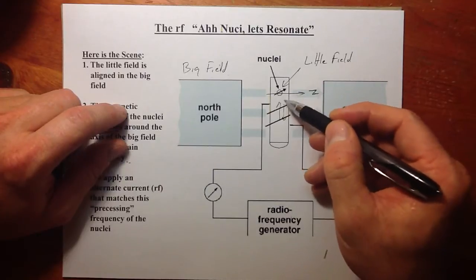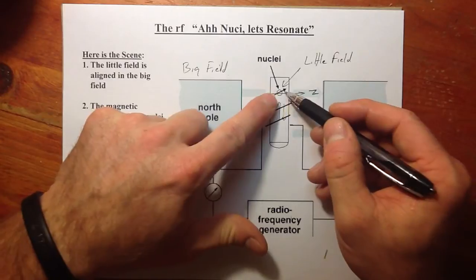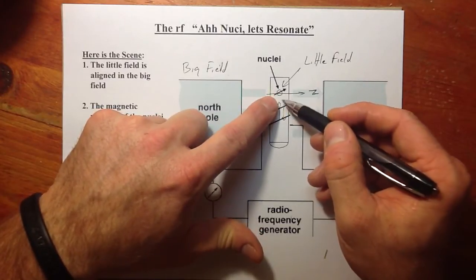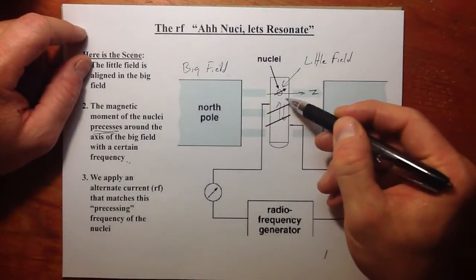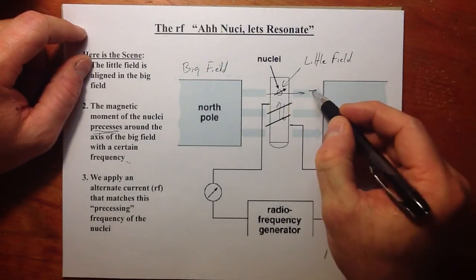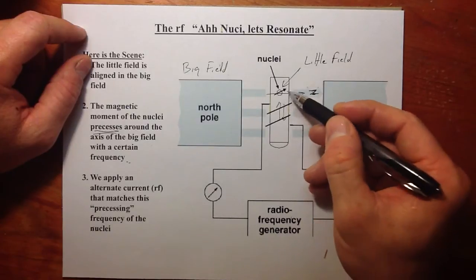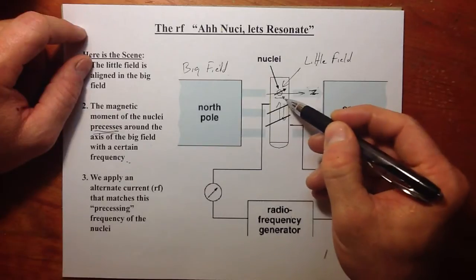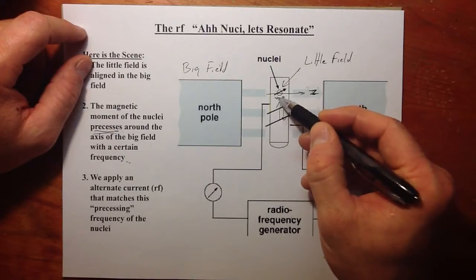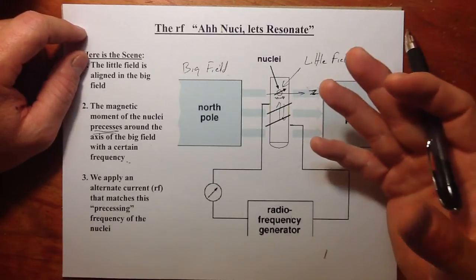But we had some precession, and we can grab this nuclei's little field because it has some XY component. Its precession is in a different dimension. Its set value is not changing in the Z-axis. It's going to have a certain length always as it precesses about. But there's going to be some components to its magnetic field that we can manipulate or that we can grab.